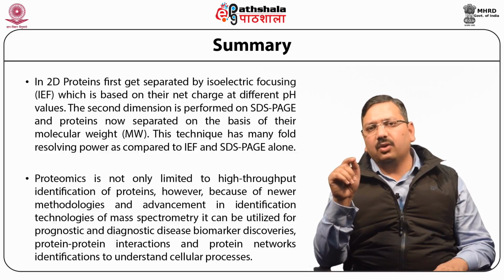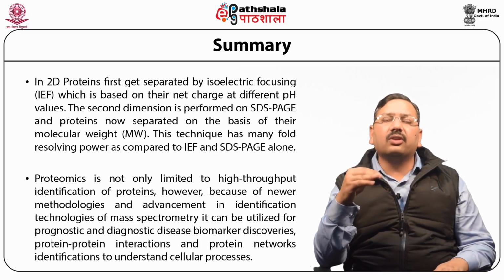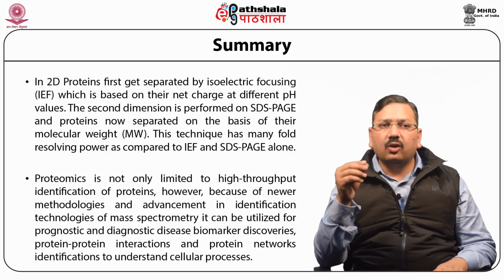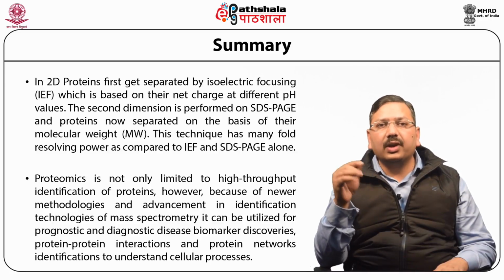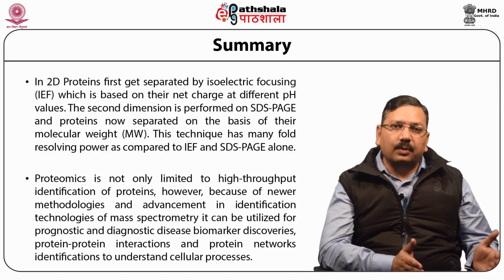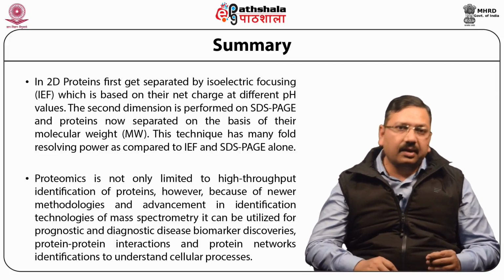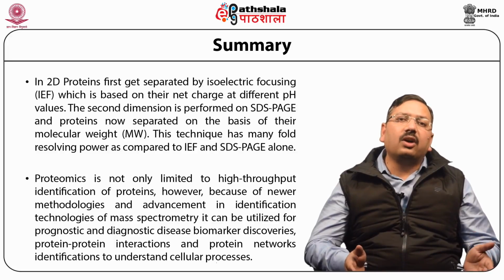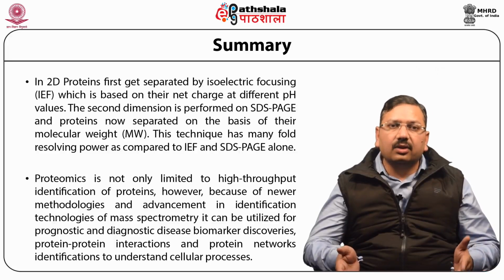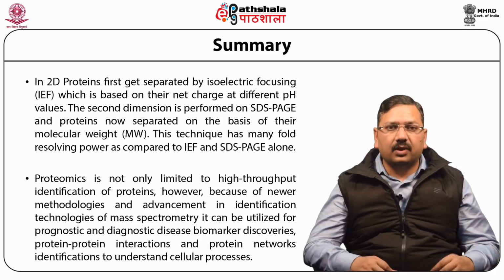The first limitation is the solubility problem of the proteins, that certain proteins cannot be solubilized properly, so you will get a lesser number of proteins in gel-based proteomics or gel-free proteomics. The second thing is that some proteins are not abundant, like kinases. So if the expression is lesser, there is a lesser chance of identification of these proteins.